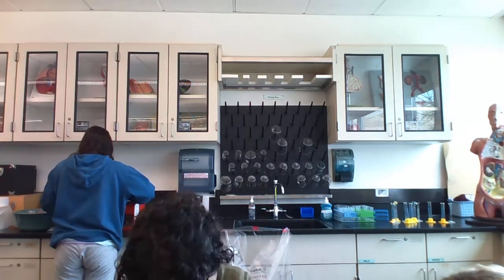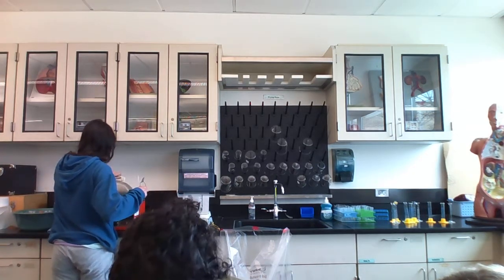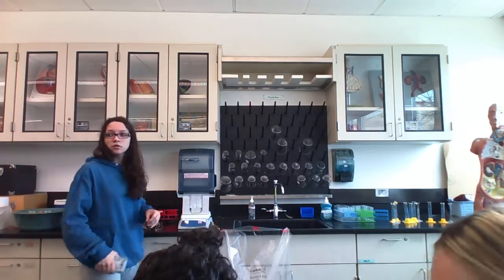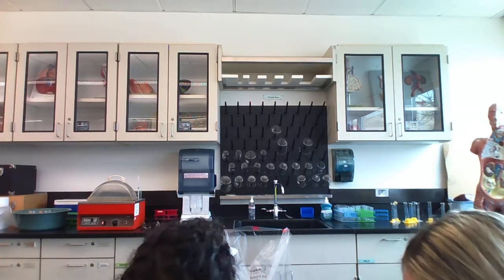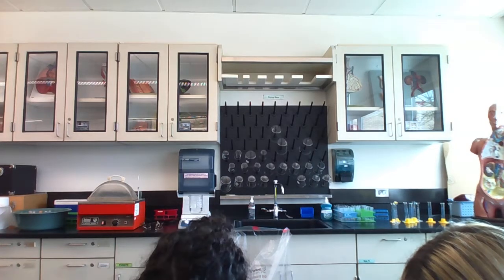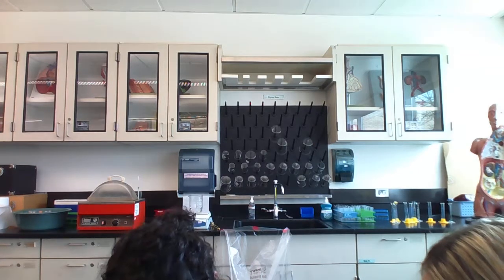And then the second one is all fat basically with no lipase. So that's another control, I guess, because nothing should happen in either of those. Nothing should happen. Yeah, because with water and litmus cream, there'll probably be a pH reaction of some kind, especially with the heat.